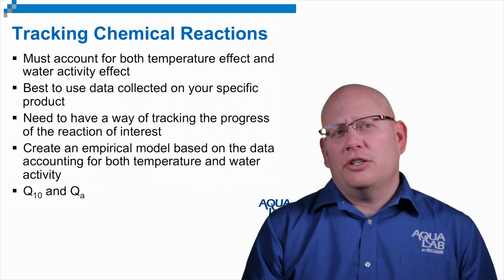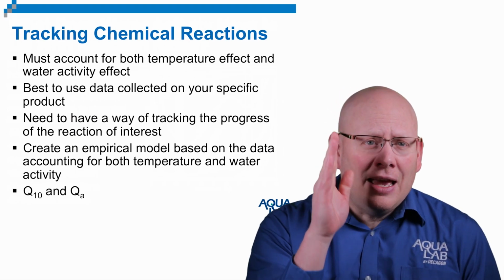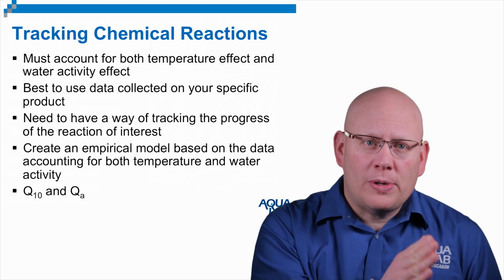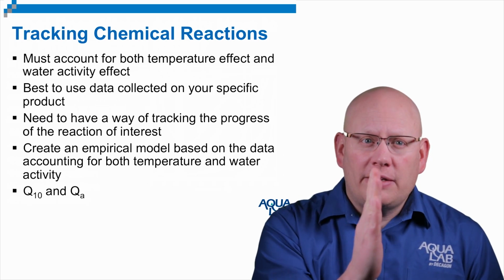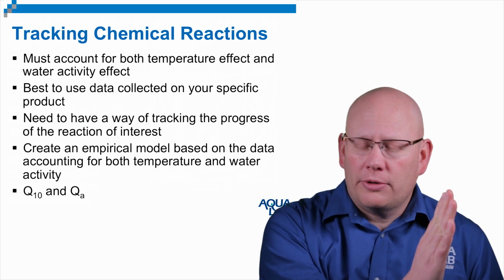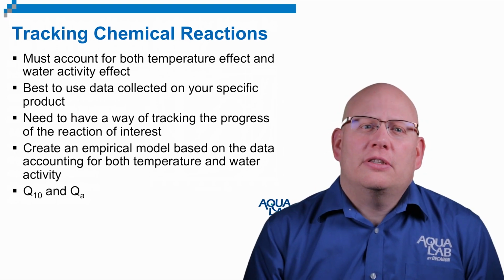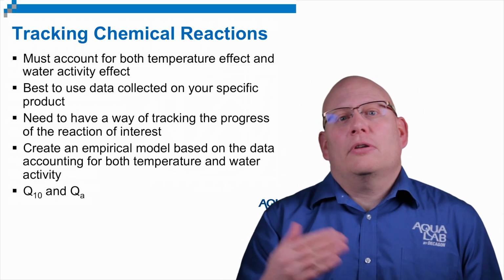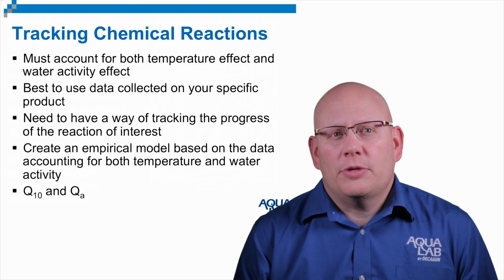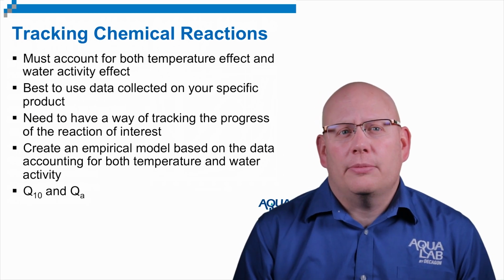If this is what actually is the thing that's causing problems, how do you go about finding that sweet spot that we identified for the texture? And we were able to identify it because when you got lower, it was bad, and when you got higher, it was bad. Well, where is the sweet spot for these chemical reactions? And in reality, the monolayer value, which you can determine from the isotherm, is supposed to represent the most stable state for any kind of material.